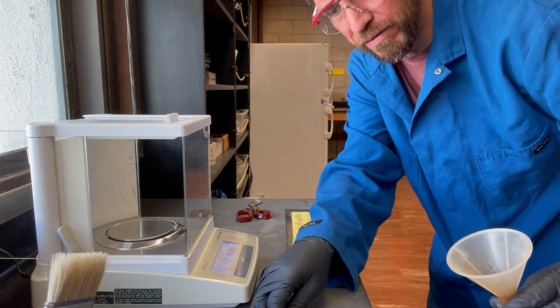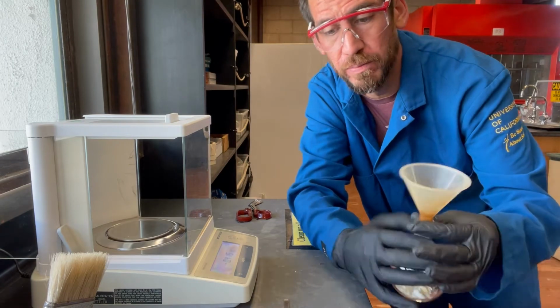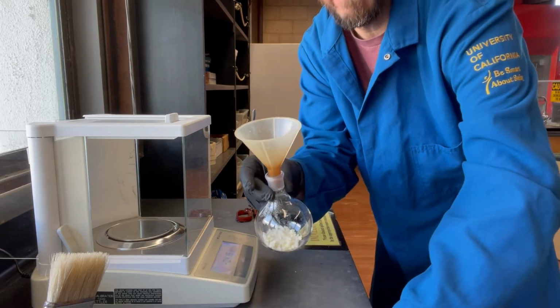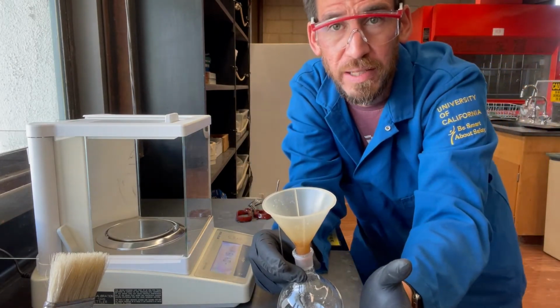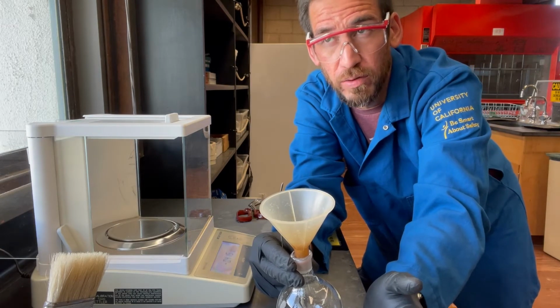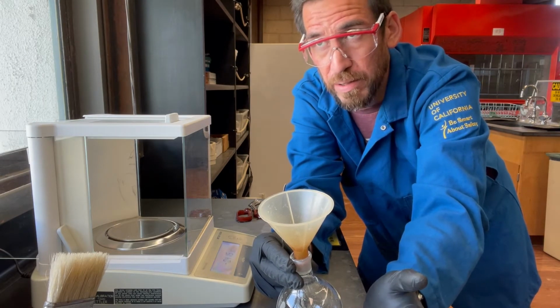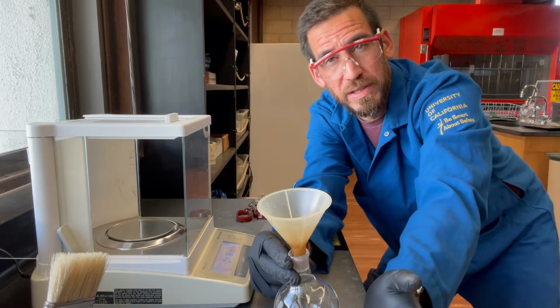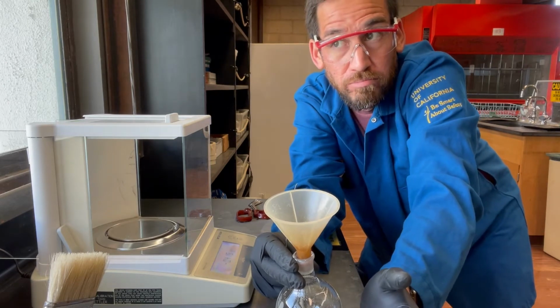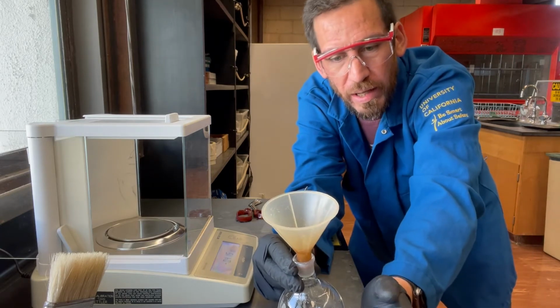So the reason why we want to use 5 grams, well, generally we do have extra, right? So you may or may not have noticed that we do have a good amount extra. And so generally in this multi-step synthesis, you all as students will run through this process over like a month, right? First step, second step, now we're on the second step, and then we go third and fourth. If you run out of material because your yield is so bad, by the time you get to the end, then I would let you start over, but you're not gonna finish it probably. So you have to have good technique.